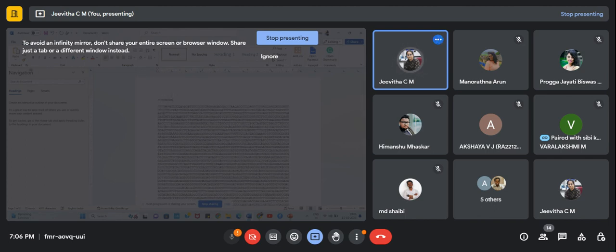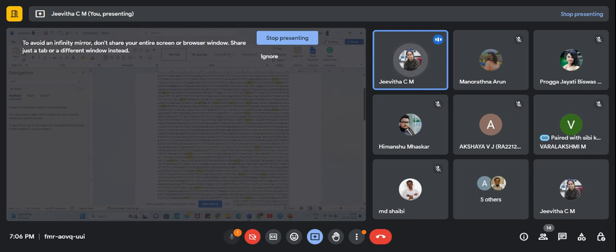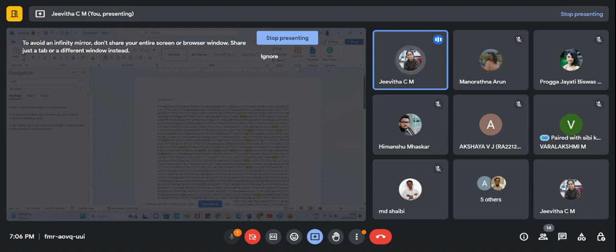In this case, your CDS region means it begins with ATG. If you are searching for ATG, there will be hundreds of ATGs in this. You can see there are many ATGs, but you don't know where that CDS region begins. You can't randomly take some ATG sequence beginning as a CDS region. In that case, we have to use one software called ORF Finder.